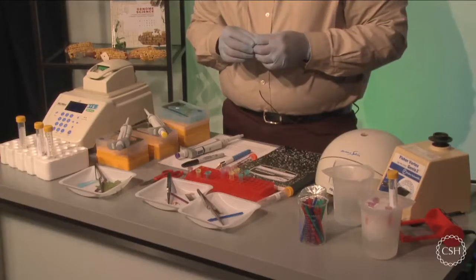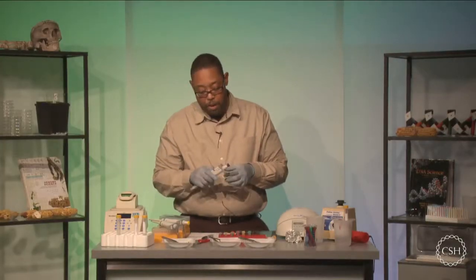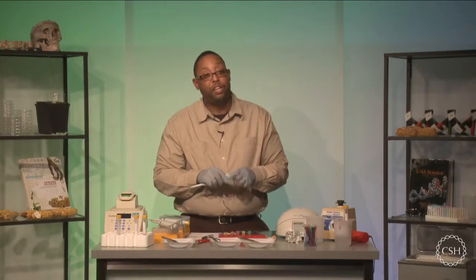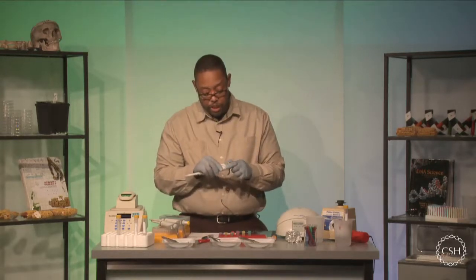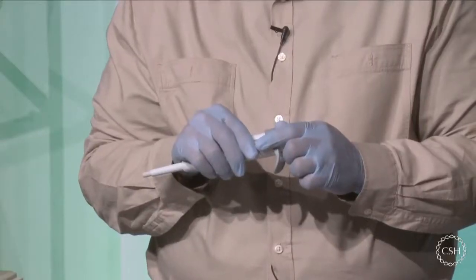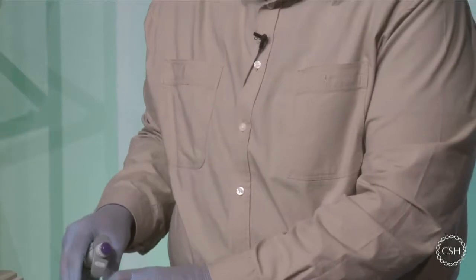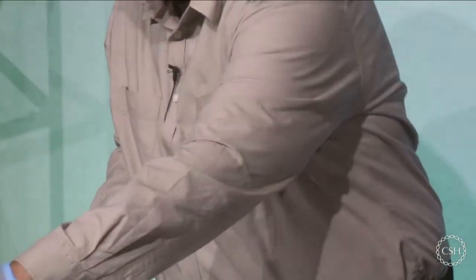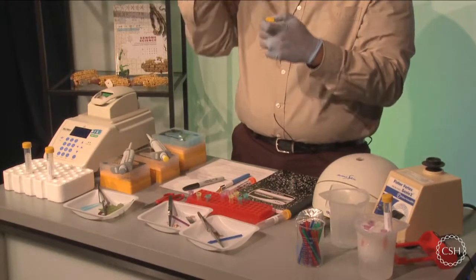And now I can start adding my individual reagents. The first thing that I'm going to start working with is my lysis solution. And I'm going to add 300 microliters of my lysis solution into each test tube. So I'm going to start by working with my P1000, and I'm going to take out 300 microliters and add this to each individual tube.